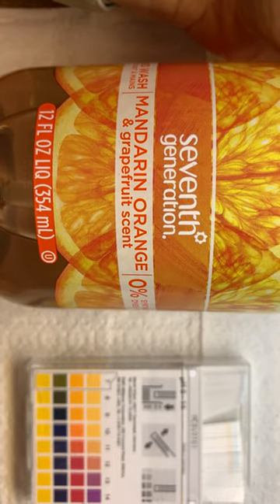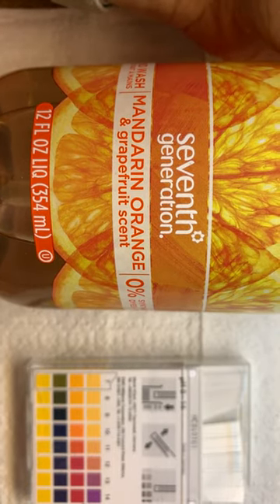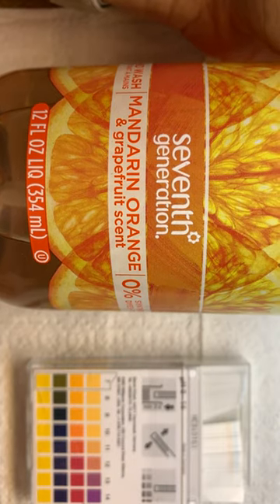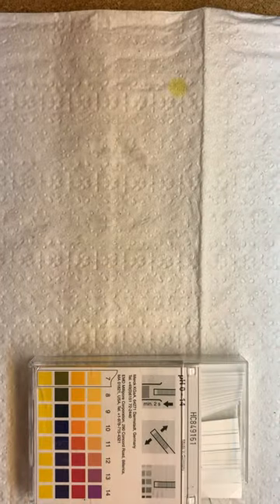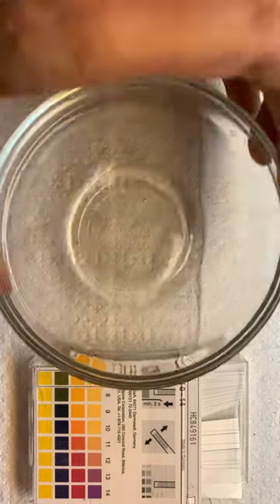This last one we're going to test is this particular one — a Seventh Generation hand soap. So let's test that out. Let's test the pH of that. We're just testing soap here.